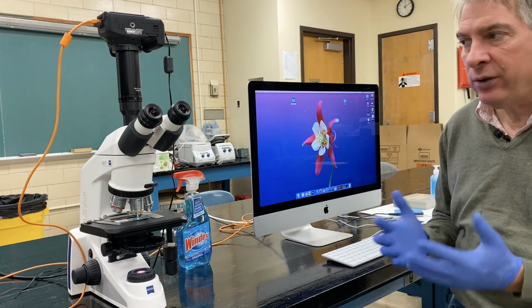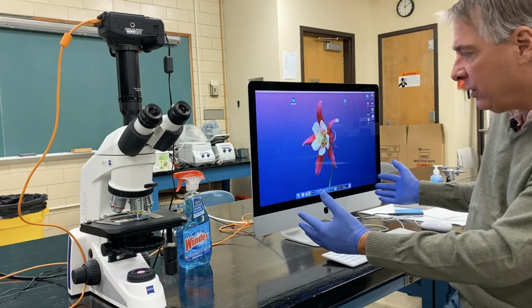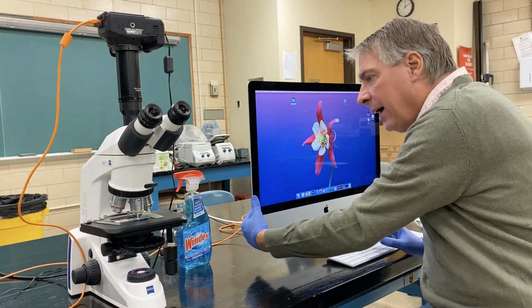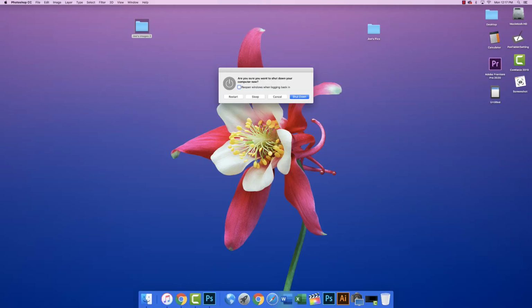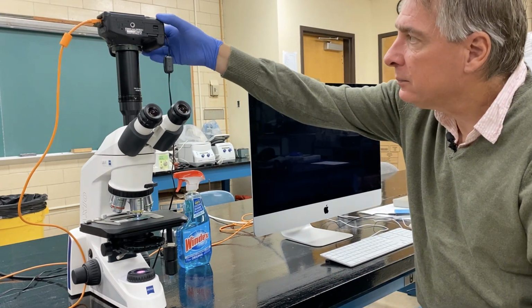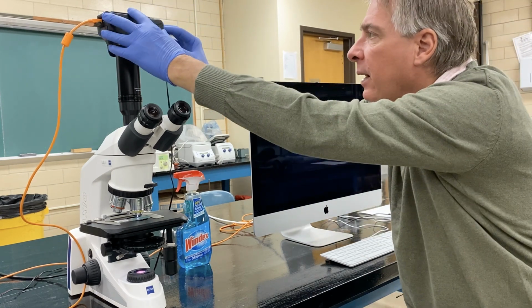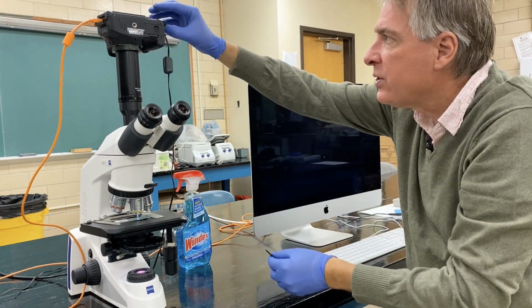Okay, you guys, after you're done, I would like you to first close out of the software package, either Photoshop or EOS Utility or both if they're still open, and then shut down the computer by pressing the power button, and then when this dialog box comes up, click Shut Down. Then we want to turn off the camera and remove our SD card by opening the door and pulling the SD card out and putting this somewhere safe.